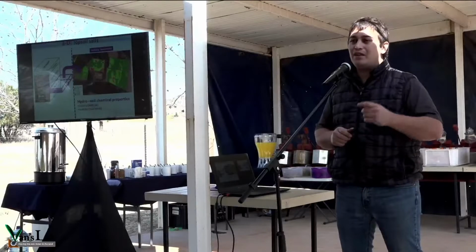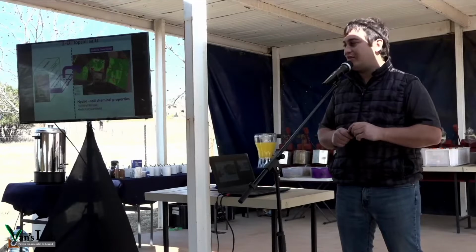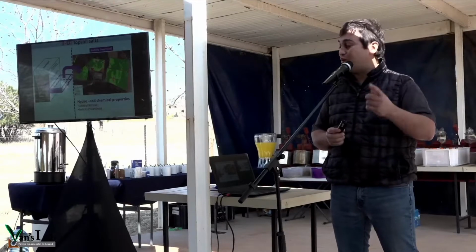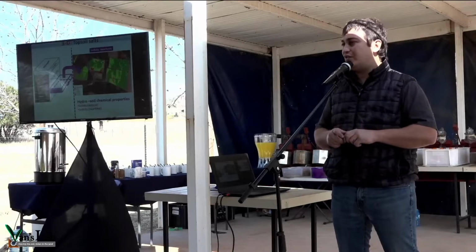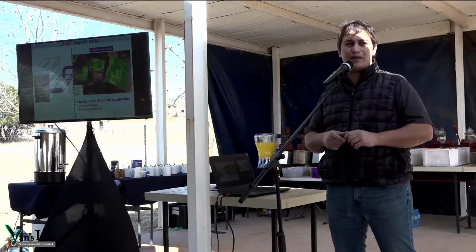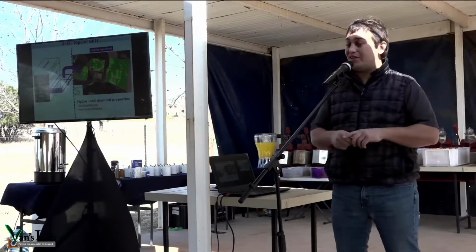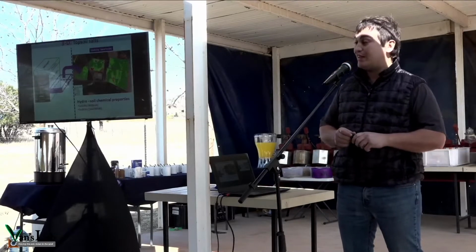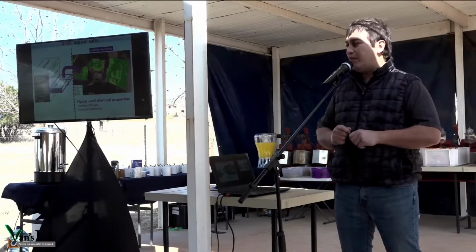Sodicity, in terms of the chemical analysis, you can't analyze for salinity or sodicity with that type of analysis. There's a special analysis that you need to do for it. And you guys are also welcome afterwards to walk through the lab if you want to, and we can show you a bit more on where we do those analyses. But there's an international standard at which you have to measure that.